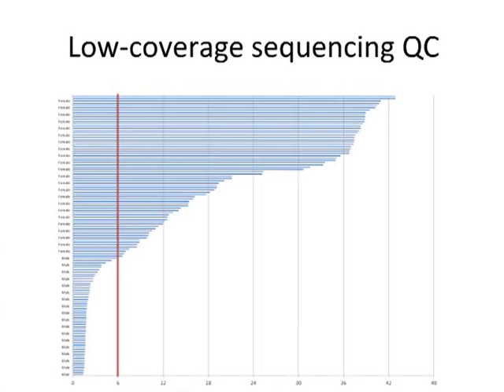If any sample labeled as male has a ratio above 6, we know that sample is cross-contaminated with at least one female sample. Some of these intermediate male samples, shown here, are a flag for these to be assayed with other techniques for contamination, whereas everything in the higher ratios or the very low ratios generally means that you don't have a male-female mixture of samples.